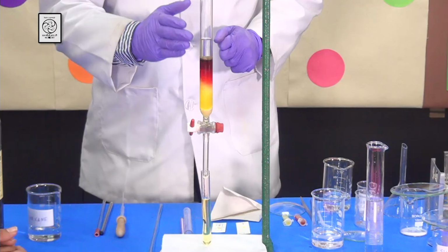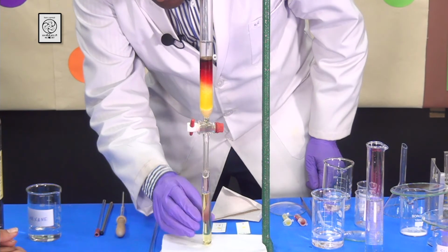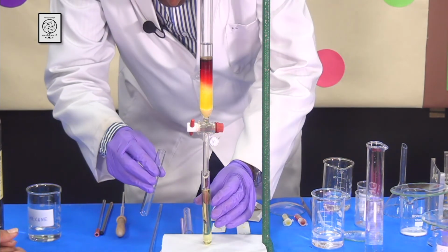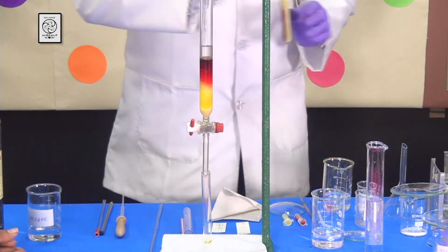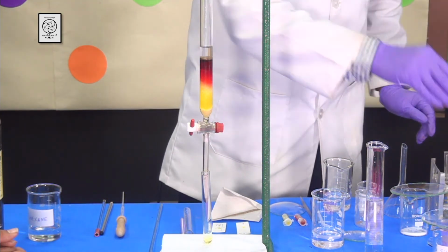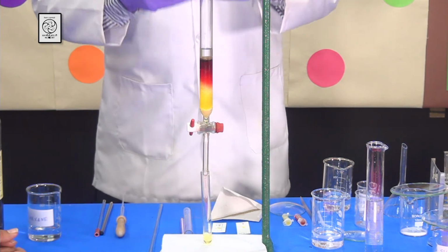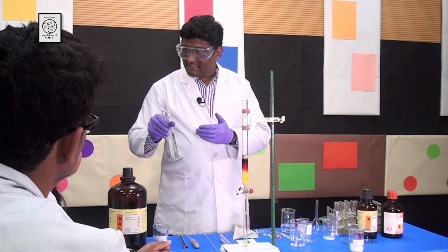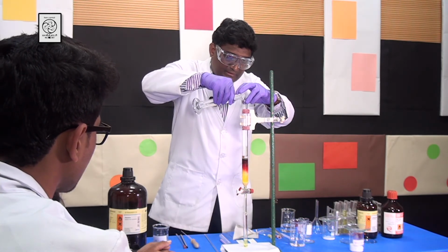Students, you can see that the yellow compound is moving much faster compared to the red compound. As one of my test tubes is already getting filled, I will take a new test tube and put it here, and I will collect more of the yellow compound. You can see that my mobile phase is getting used. So I need to add more of the mobile phase, which is the same 80-20 mixture of hexane and ethyl acetate, and I am going to add it very carefully.